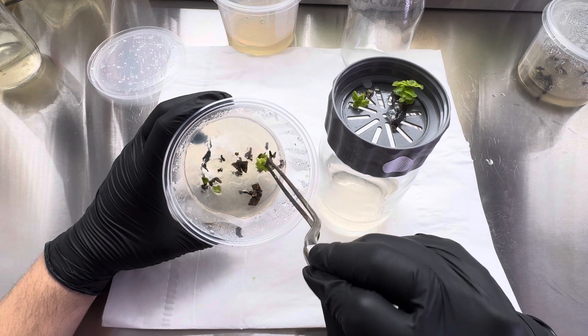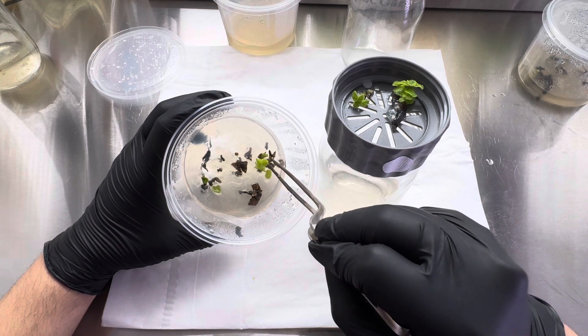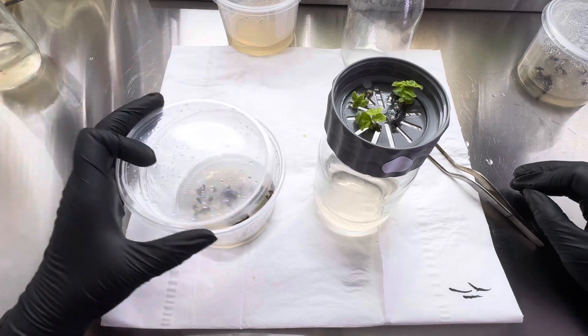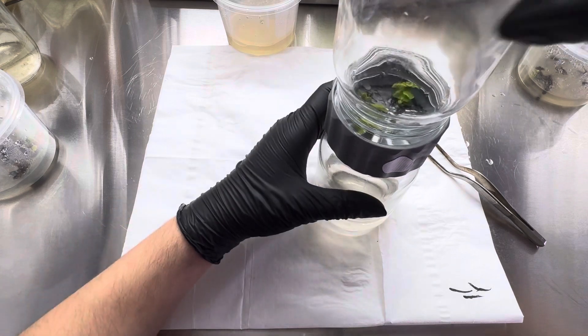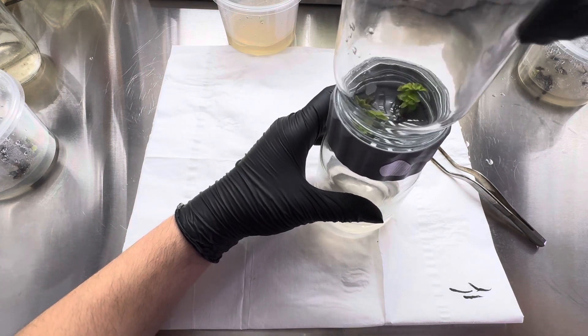That dead tissue just comes off really easily. And then put that over, making sure I'm not crushing any of the plantlets.